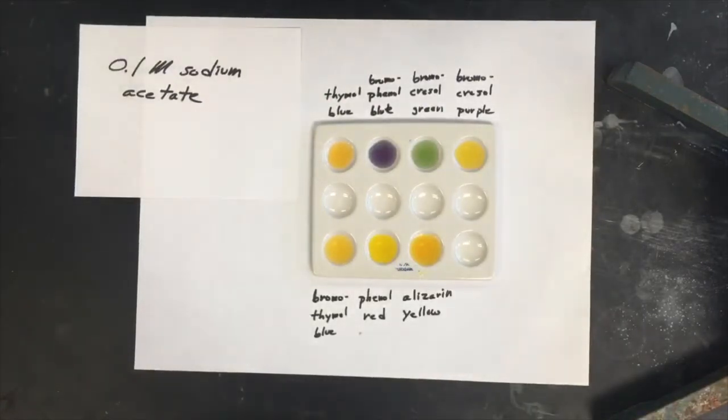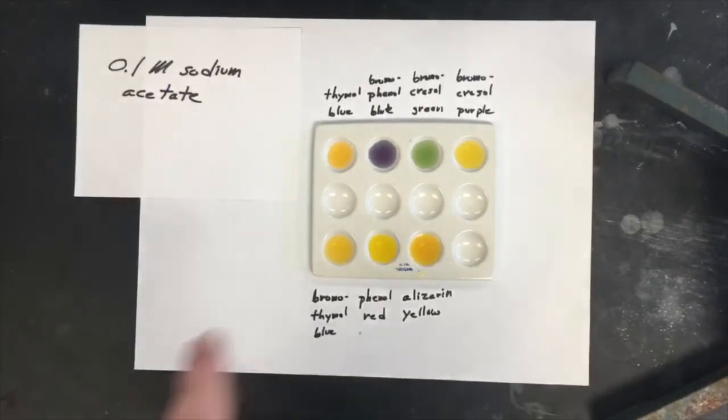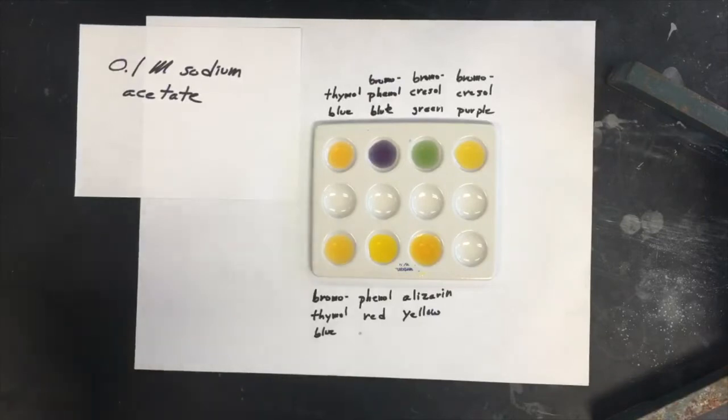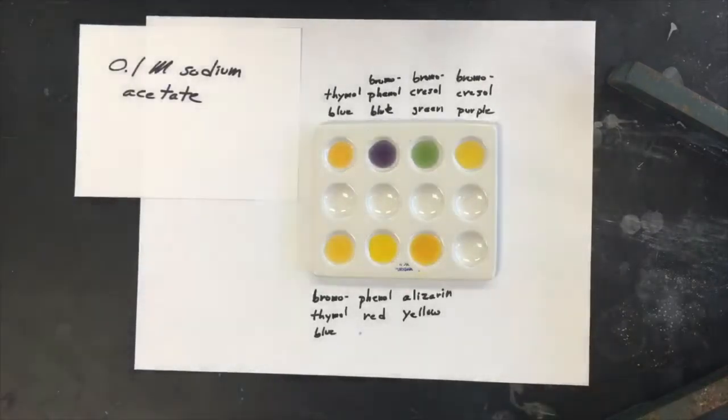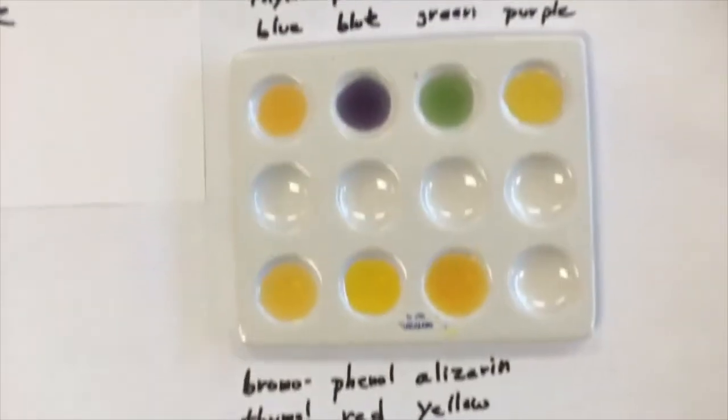So here's the next solution being tested. It's 0.1 molar sodium acetate. And we have the indicators in the same wells as before and labeled on the page. I mixed three drops of sodium acetate, 0.1 molar with one or two drops of each of the indicators. Mixed each well with a glass rod rinsing in between. So let me zoom in so you can see a little bit better or maybe take a little bit more note of what's going on.